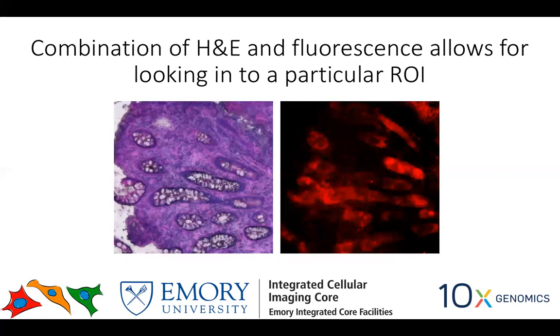Okay. So once you have selected that, we can also pinpoint which areas have higher mRNA signal per se. So we can overlay your H&E stain with the nucleotide stain. This is in case that is of your interest.